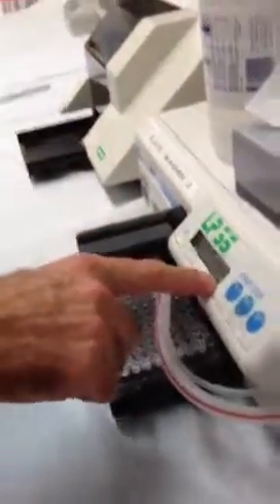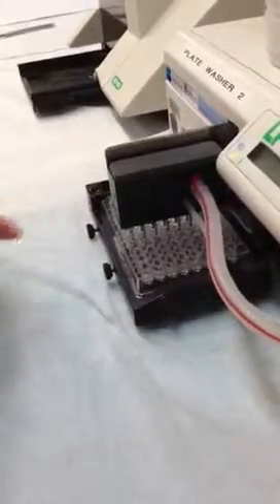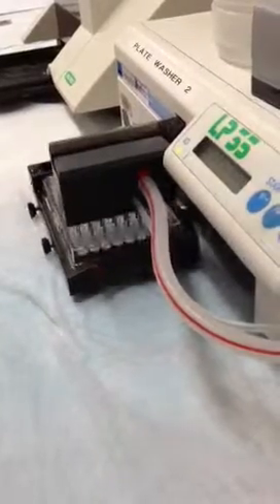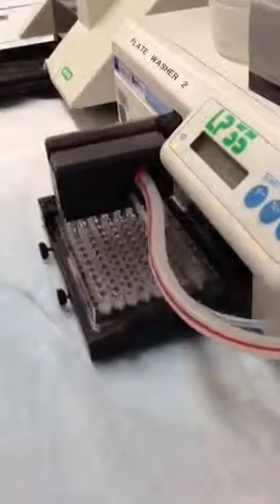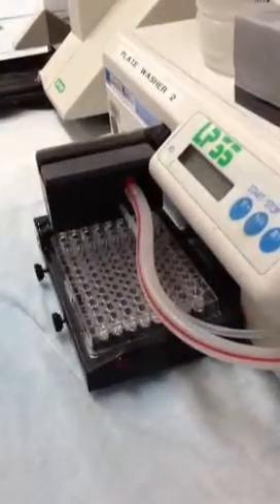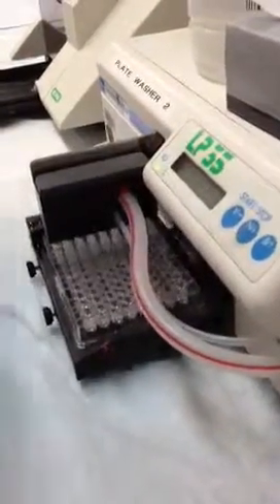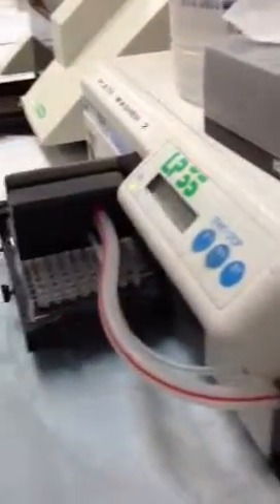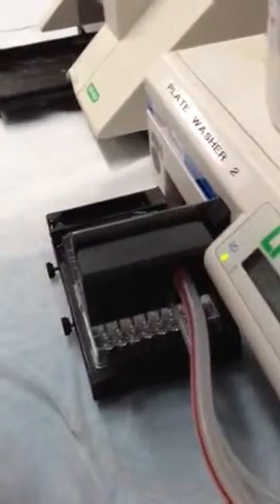If you're only using six strips then just six. Try Wash Cycle 7, which is the one we've been using. It's sort of like hitting the bottom of the plate — is that going to be a problem? No, not if you're not doing cells. It's straight like an antibody assay. The last step is where it sucks up and there shouldn't be much left.